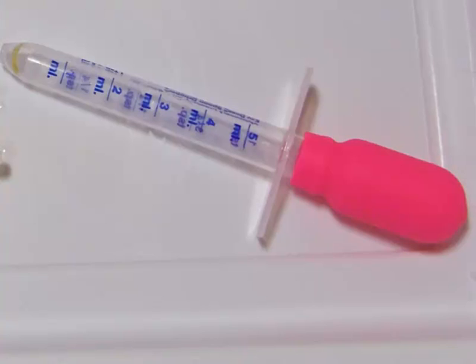Dosing droppers work great if you only have a few cups to inoculate. They only hold about one teaspoon, so if you have more than eight or sixteen cups, you really want to use something different.